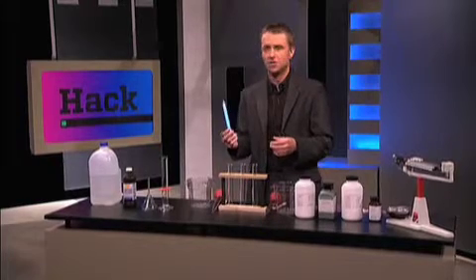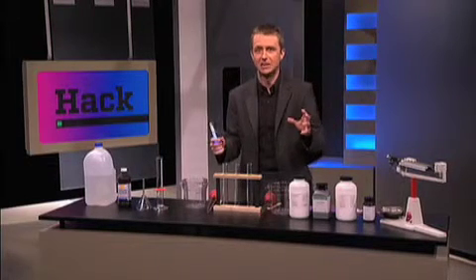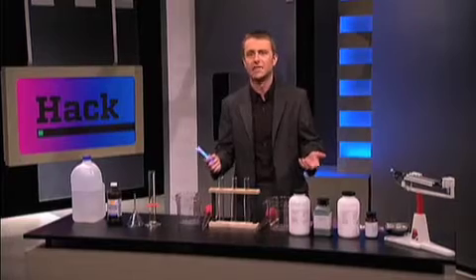What happens with these glow sticks is that two liquids combine in there, and then when you snap and shake it, it's sort of an industrial version of a firefly mating dance, and that's called chemoluminescence. That's actually the production of light from chemistry. So tonight, we're going to try to make our own glow sticks, because why should the glow stick industry fat cats have all the fun?